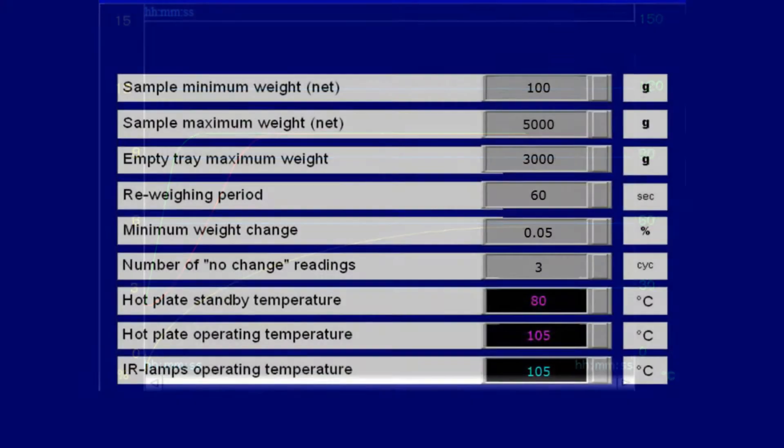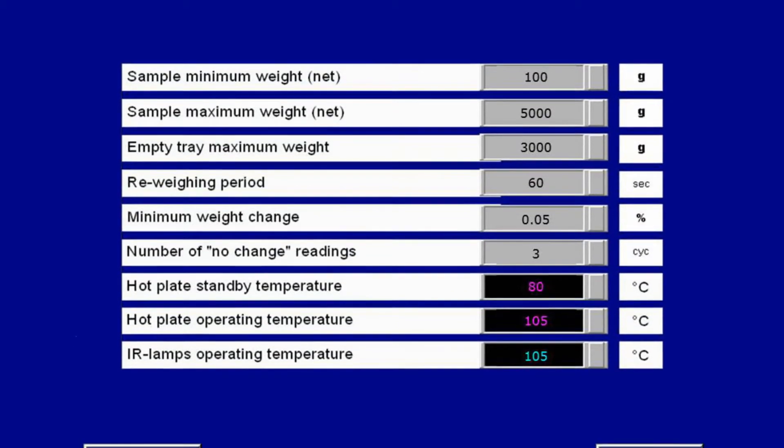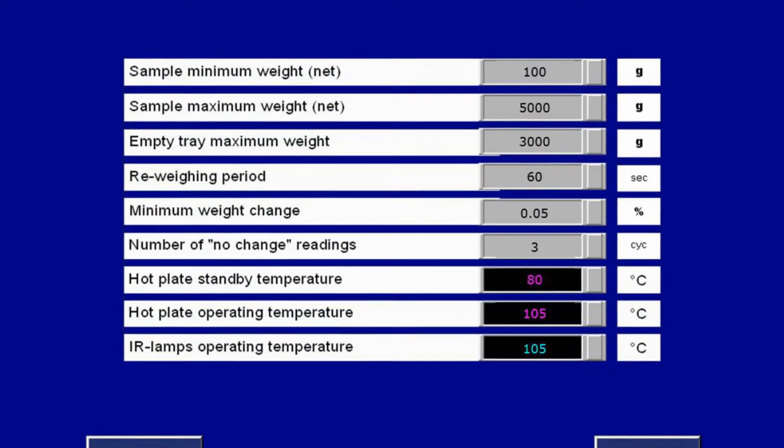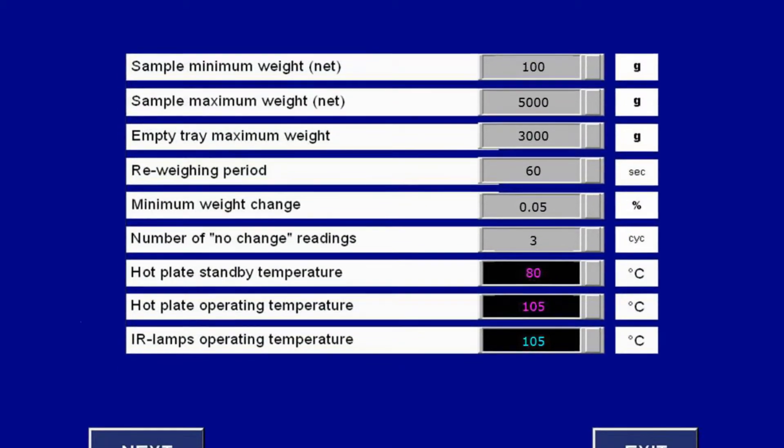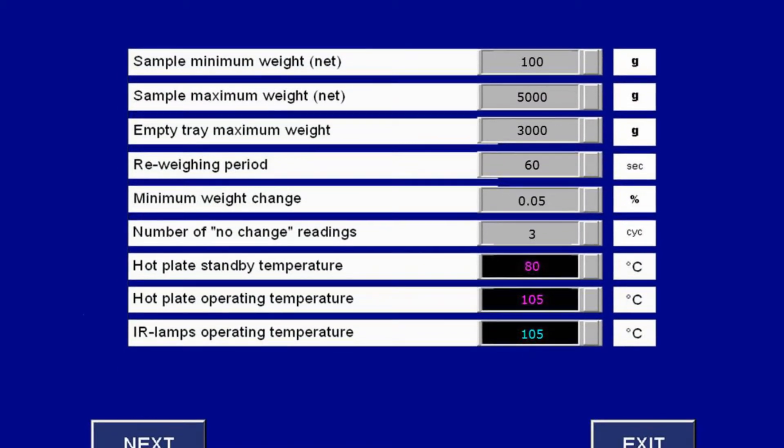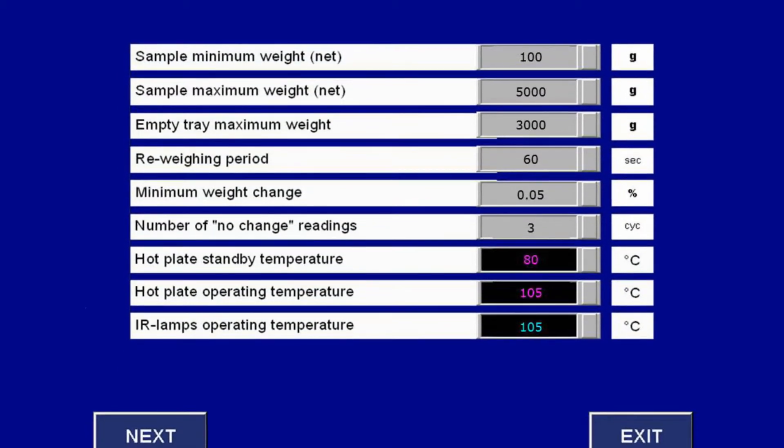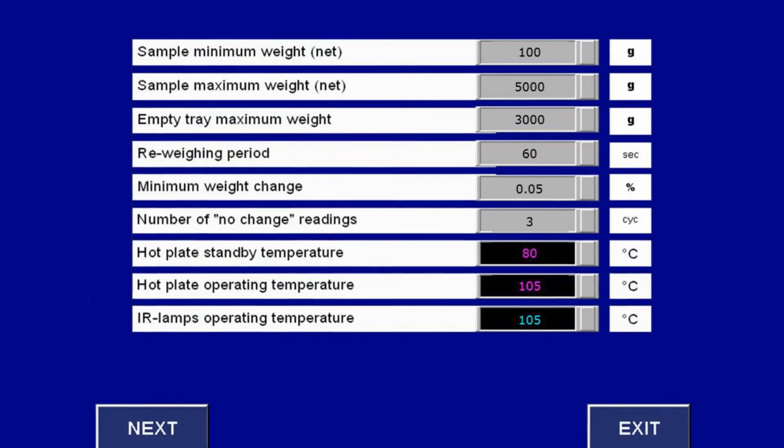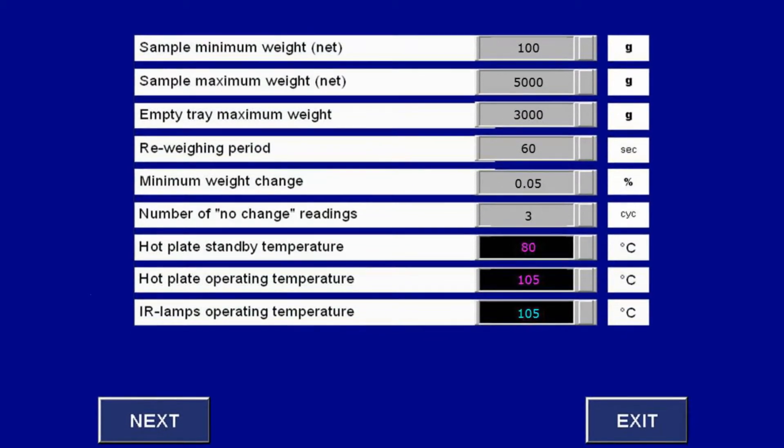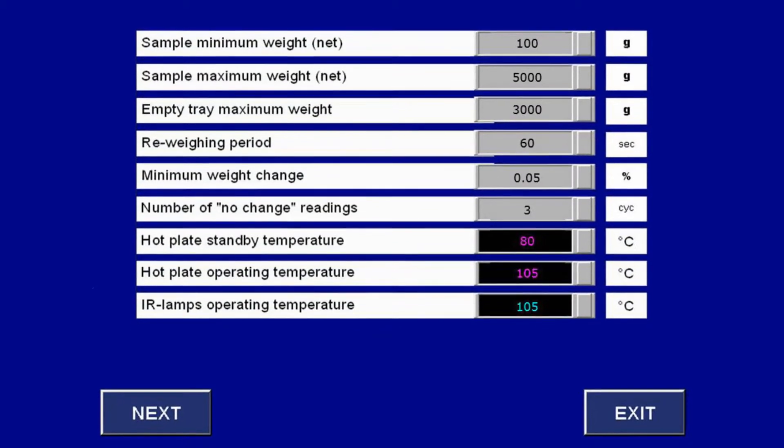When the sample reaches the end point of the drying process, which can be specified by the user, the drying cycle automatically ends, saving time and power.